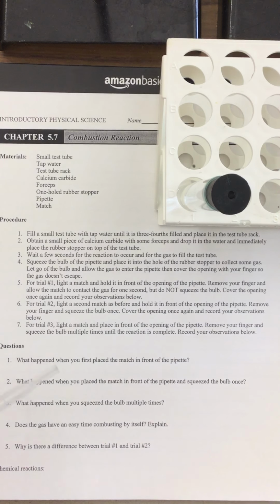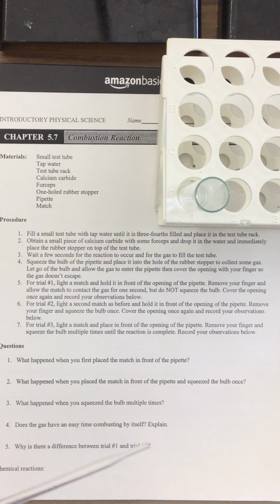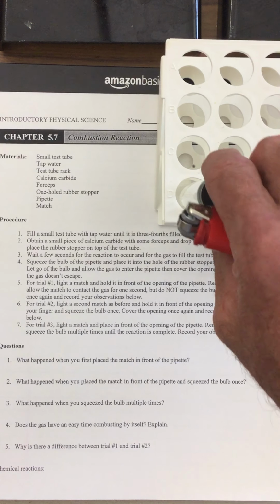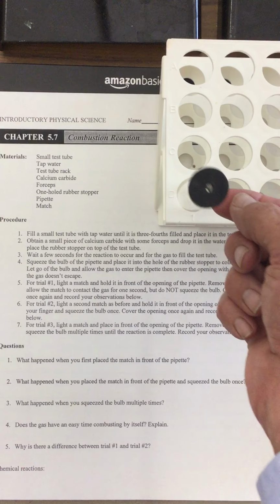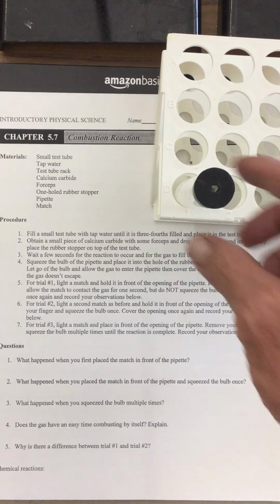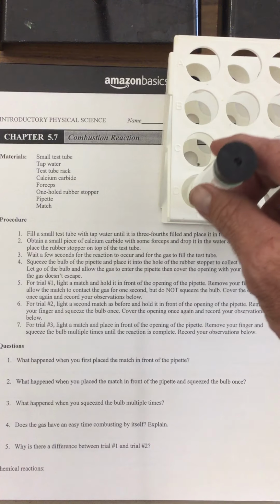So here we go for the chemical reaction. So here's my piece of calcium carbide. I'm going to drop it in. We should probably see some bubbles forming. Okay, so I'm going to now cover this up. So right now, the air that's in there is being pushed out, and it's filling up with some of the gases that are being produced from this. You can see some of those bubbles being produced.